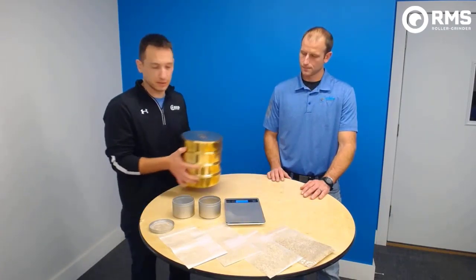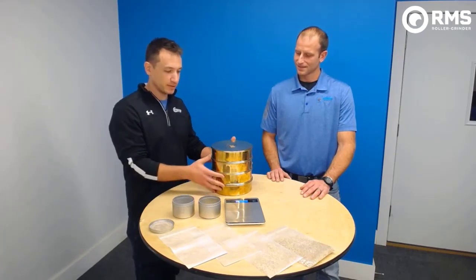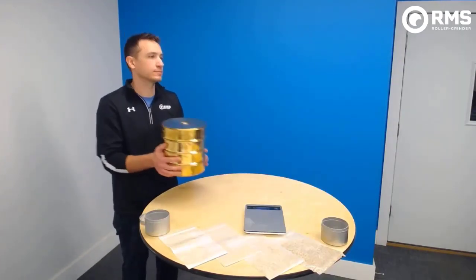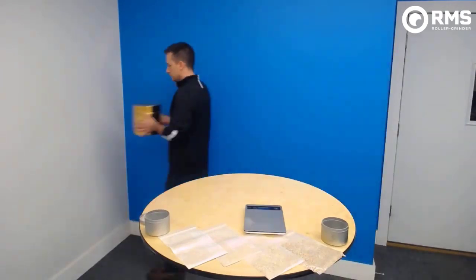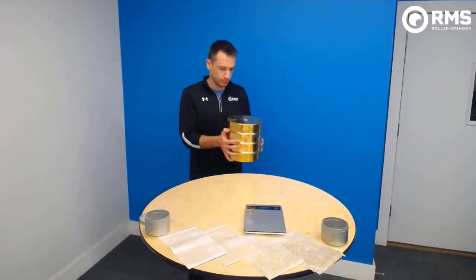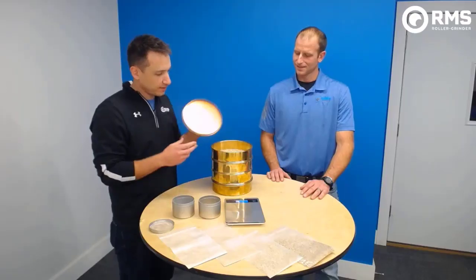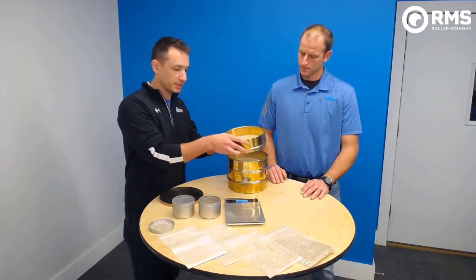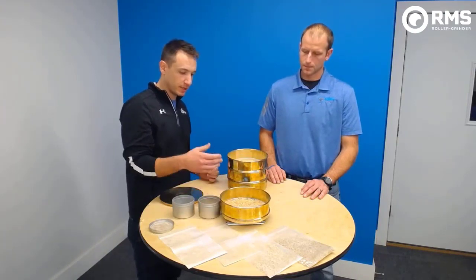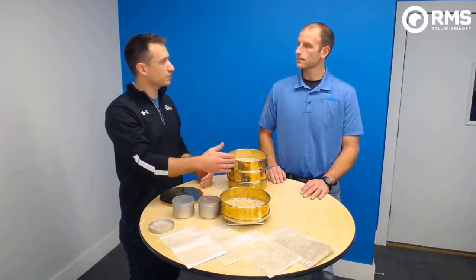Put the cover on and then shake it back and forth for about five minutes. After shaking, take each one of the sieves with the sample in it and weigh it again. Take your 14 sieve, weigh it, and get the new weight of that sieve with the sample in it — that tells you how many grams you have in that sieve. Do that for each one of the sieves.